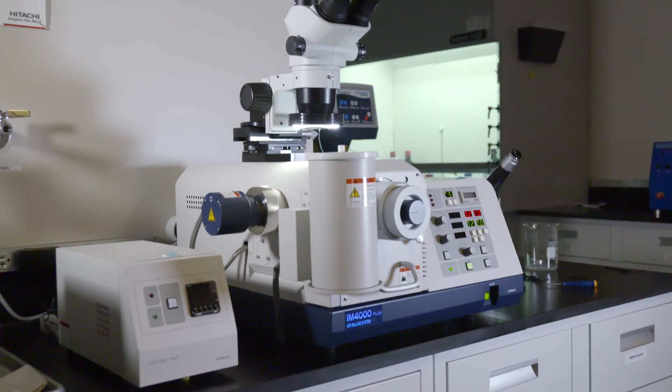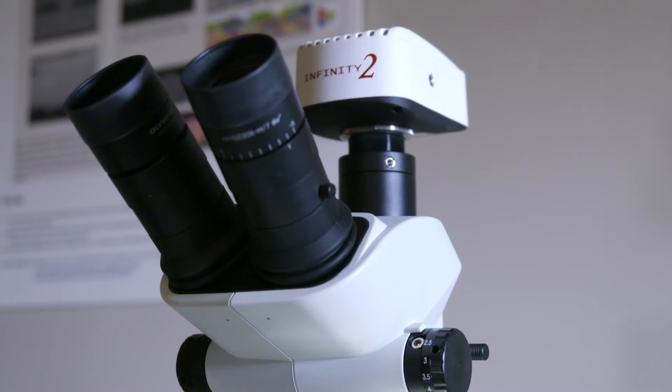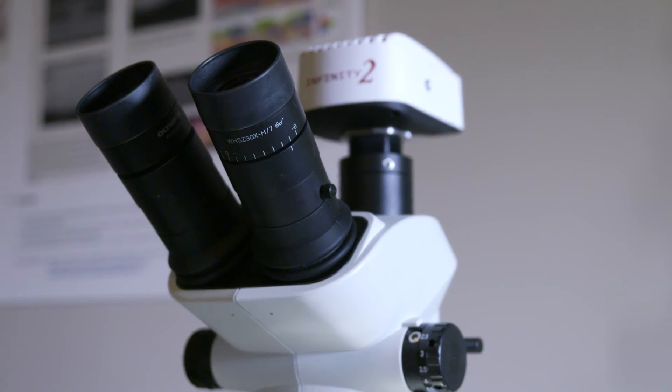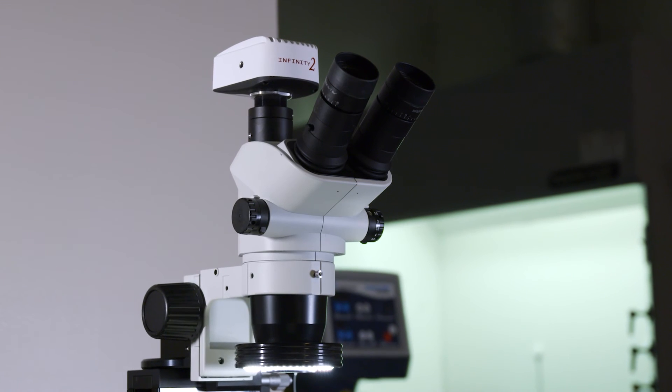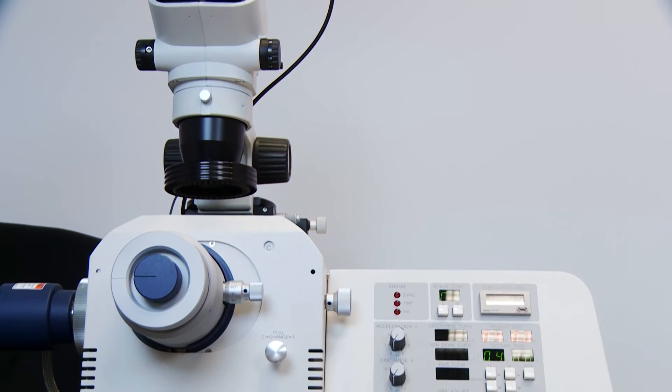With the optional mounted optical microscope, live inspection while Ion milling can be used to determine the extent of milling. In addition, the USB CCD camera can be connected to a PC and used for timed capture sequences, saving image data or post-image processing using the Infinity Capture imaging software.